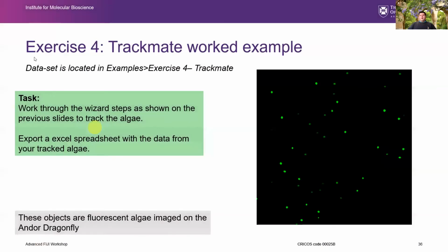And so if you do combine TrackMate with other parts of your workflow, remember to cite it. And now you can hopefully see that using some of these tools that have been developed by other people and are available for you to download and use, you can do a lot of tasks really robustly, repeatably, and you don't have to code at all to do this.